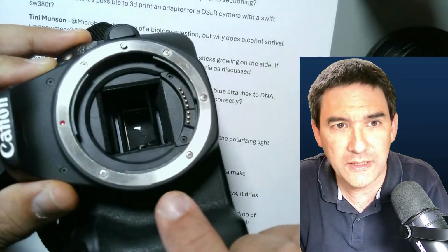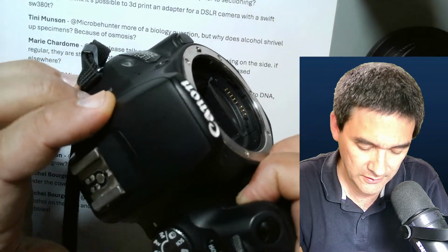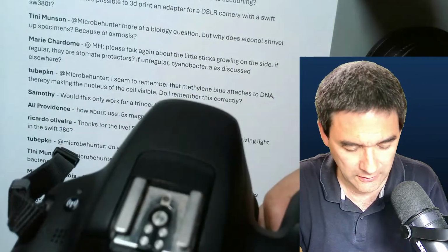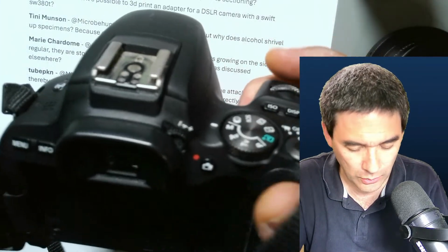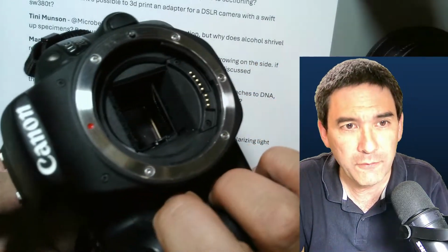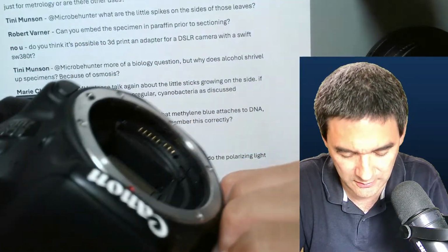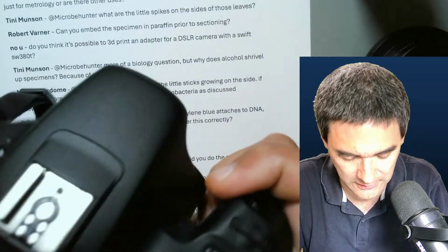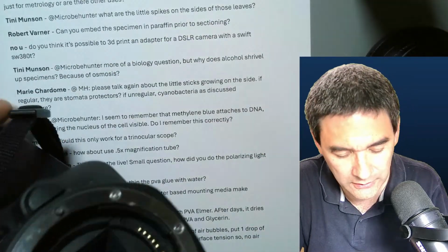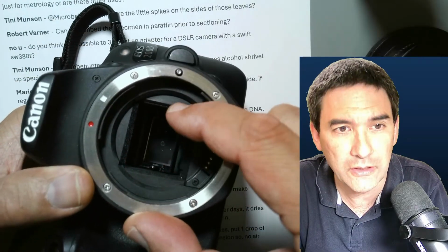There's a mirror in here, right? And if I am to open this up, let me quickly do this. There's no card in the camera. I don't know if it's even going to release because I don't have a card now. Okay, it doesn't matter. In any case, you get the idea that the sensor covers nearly the whole area here.